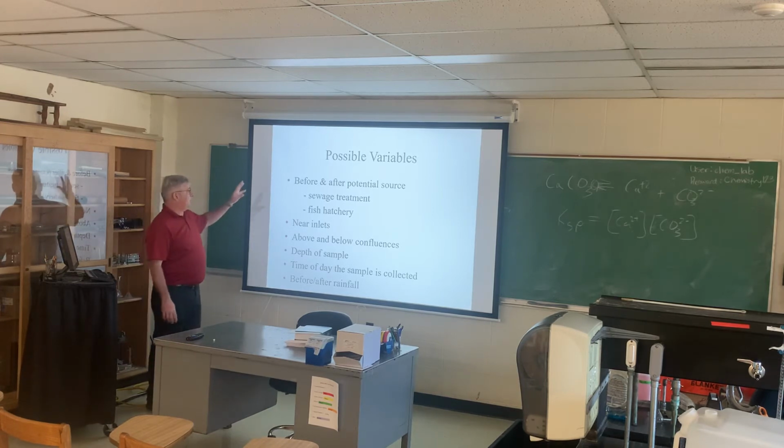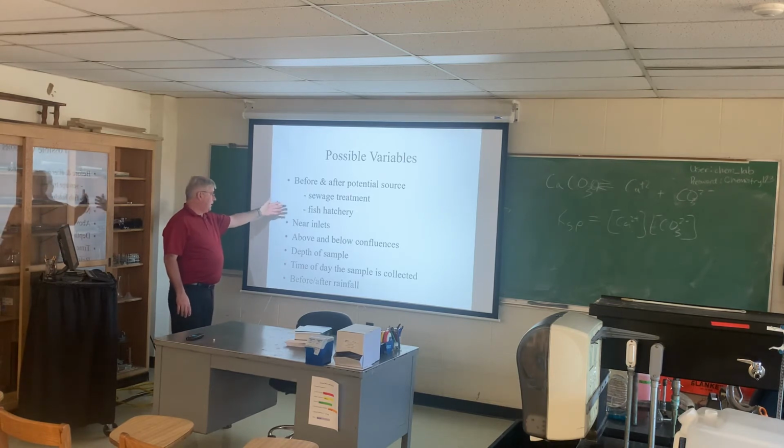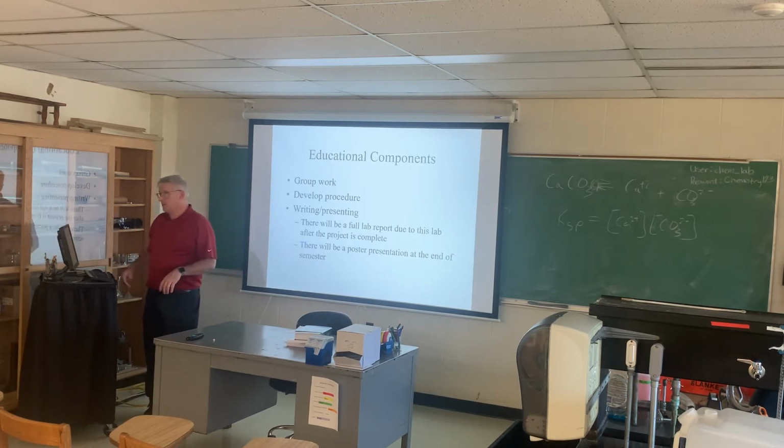Okay, so anyway, possible variables, I've already mentioned those. Near inlets or confluences, above and below them, to see if two different streams have an effect on each other, the depth of sample, time of day, and so on. So those are variables that are all possible.